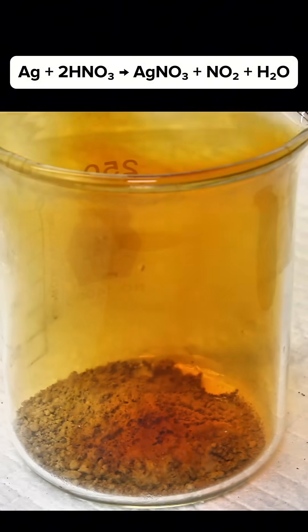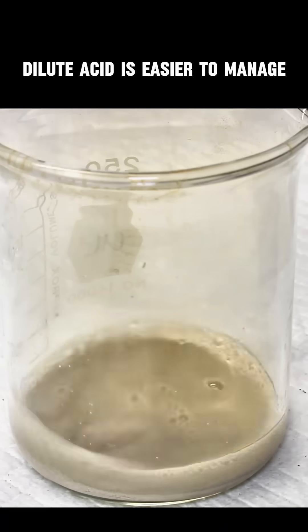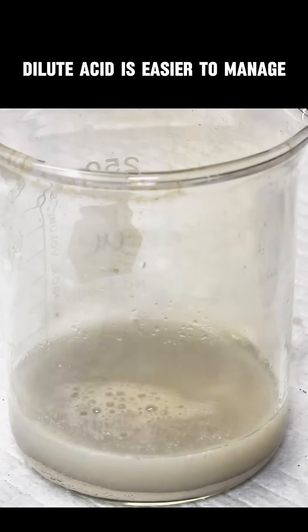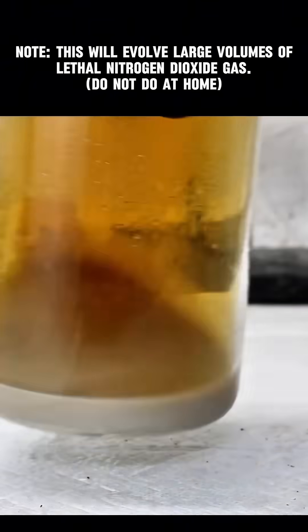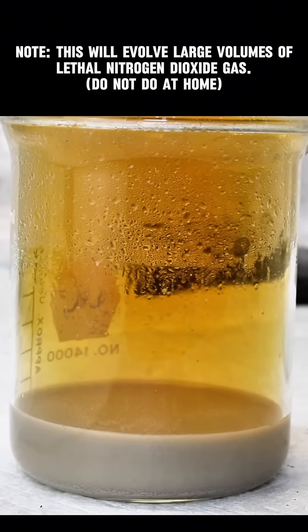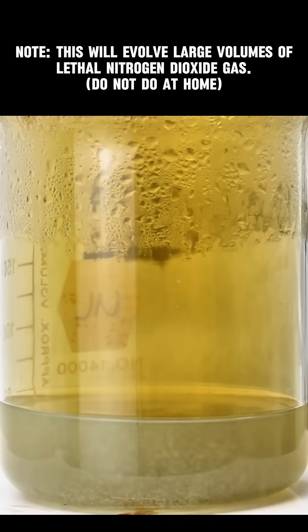However, it does produce a lot of incredibly toxic nitrogen dioxide fumes which are really not safe to breathe. This can be reduced somewhat by using more dilute acid, but in general I don't recommend trying this unless you really know what you're doing. Honestly, I don't think the average person has concentrated nitric acid anyway, so it might be a moot point.